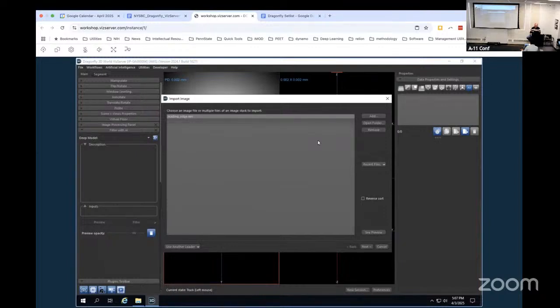Now it's going to give you, this is sort of a, go ahead. Sorry, my folder is empty. Your folder's empty. You have one called MRC, but it's empty. Actually, maybe I'm holding on. You go to the folder itself here.